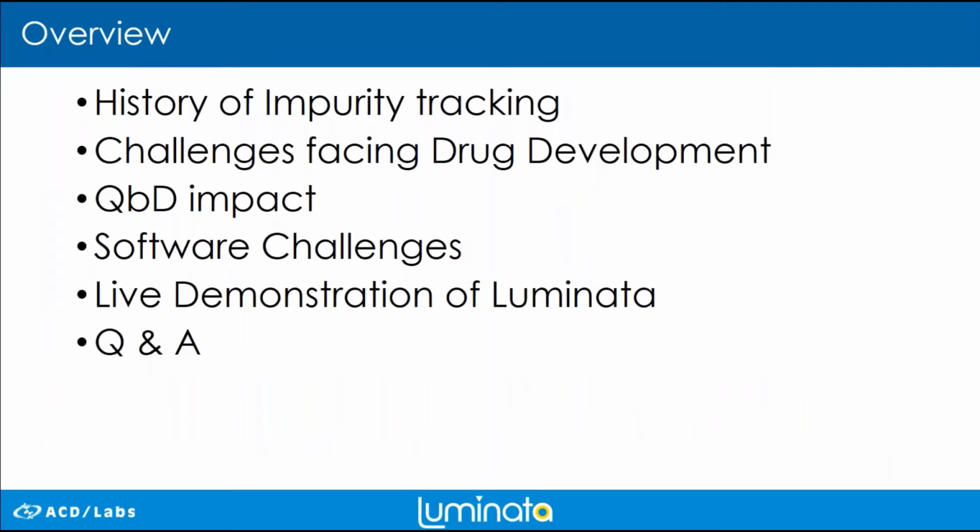Before going into the software, I just want to recap some PowerPoint slides and go through issues that have been seen in pharmaceutical development. Classic issues such as history of impurity tracking, challenges faced in drug development, and QbD impact, and really impediments seen in QbD and what's occurred in the lab and how much more data is seen through that.